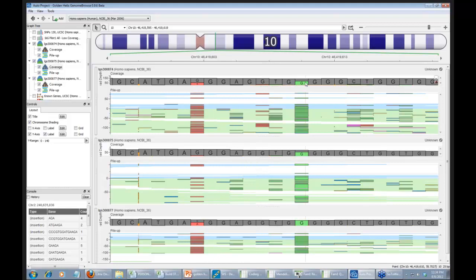You can see there's two heterozygous calls nearby where the ratio is much better. We're not really seeing anything in the parents, but if you do notice, there is another insertion deletion right by this particular region. And so, again, this is probably going to be a sequencing artifact that's caused by the presence of this insertion deletion.